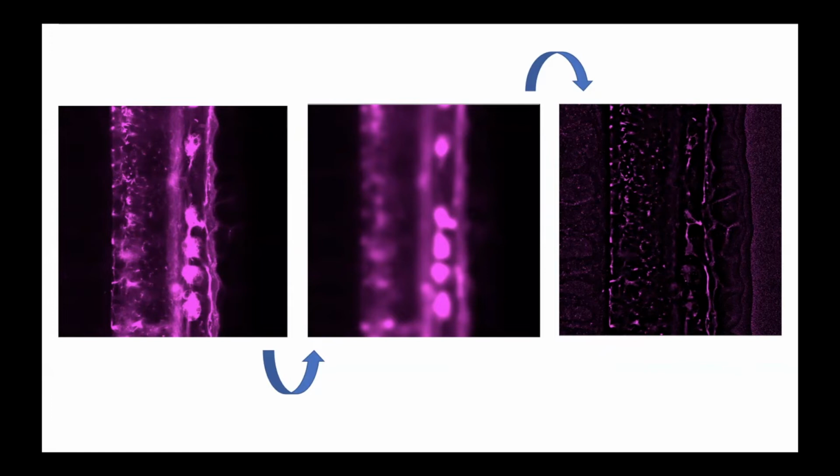So when we select this option, divide by background, CiliaQ Preparator will make a copy of the image and it will blur it with a Gaussian blur. And then the original image is divided by the blurred one, and the resulting image, which you can see here, is intermediately stored in the 32-bit format for determining the threshold and deciding which pixels are considered foreground and which ones are background.